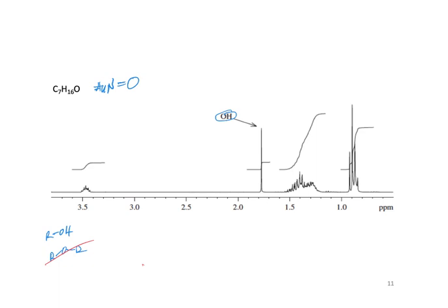Would it polarly shift? Yeah. Well, we have one downfield shift. Let's look at these integrations. What do you think? If we have this integration versus this, oh, it's 1. If this is 1, this is probably just 1.